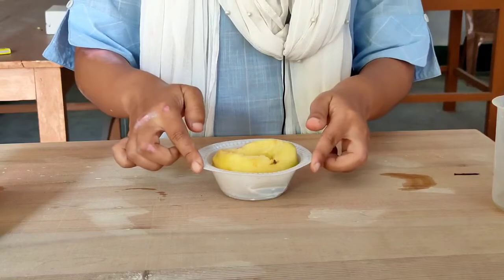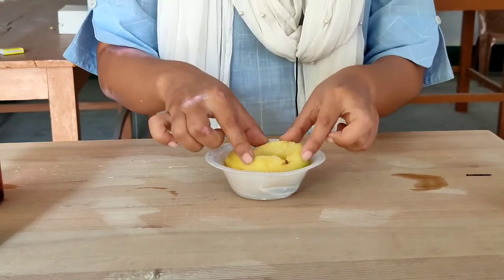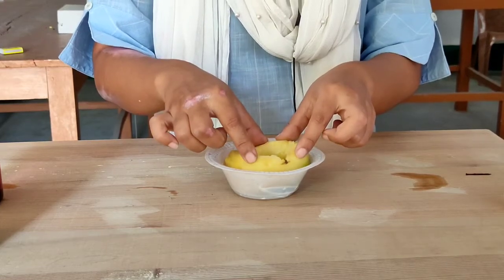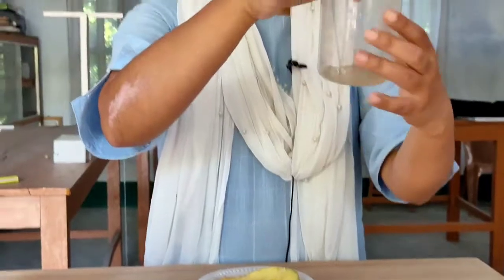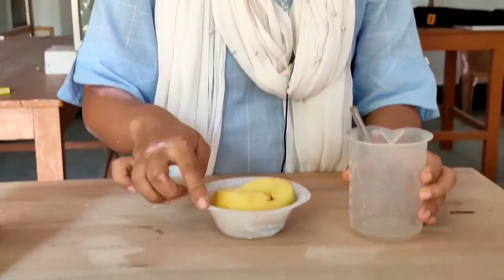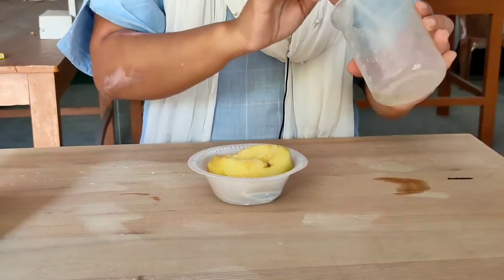Now for the potato osmoscope, like I told you, I have a potato here, drilled a hole in between, and into this container I have poured about 20 ml of water. Now in this beaker I took around 5 to 10 ml of water, less than what is present in this container, and then I have added sugar to it and made a solution out of it.